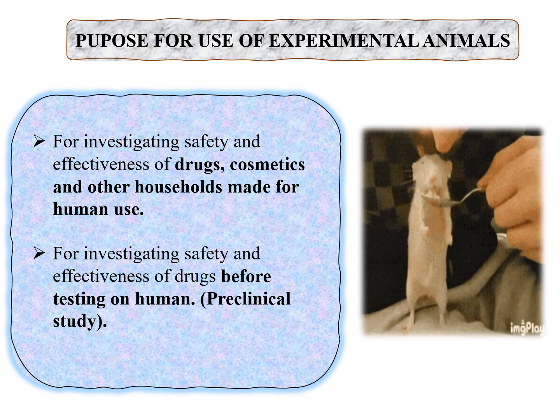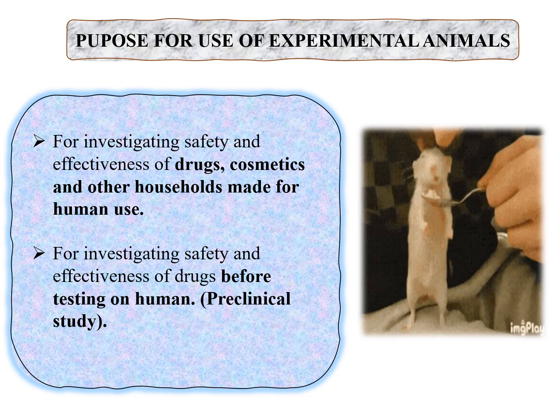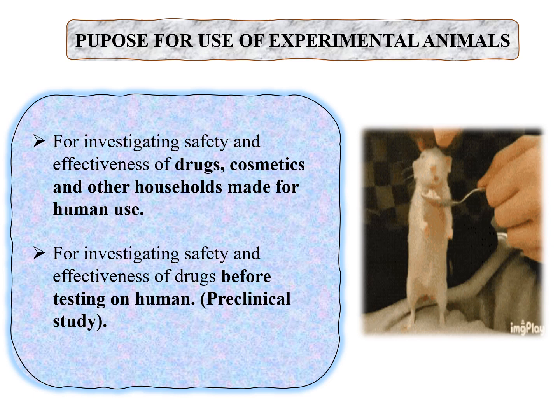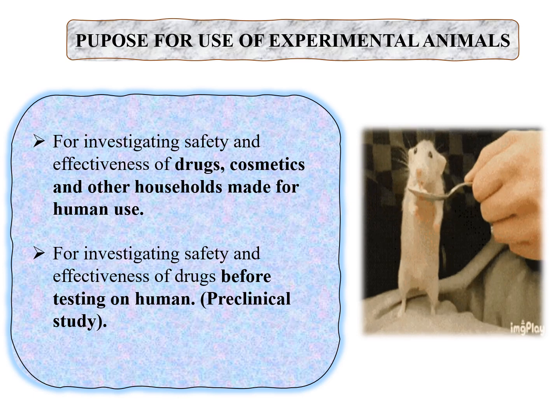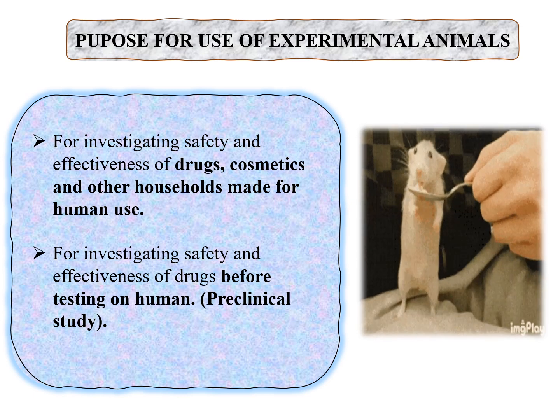So you can see that apart from the drugs, they are also used for investigating the safety and effectiveness in cosmetics and other households which are used for human use. They are also used for investigating the effectiveness of drugs before testing on humans.